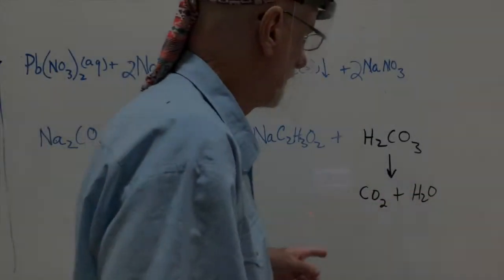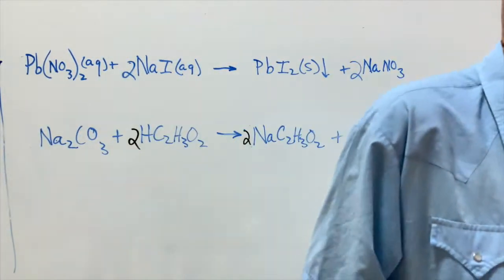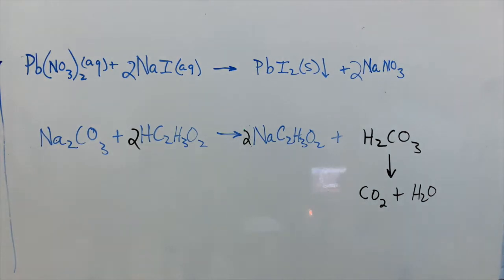Excellent. Now, I just want to review these two equations, and I'm going to do a couple of labs, quick demonstrations on what we're talking about, by the production of either a precipitate or something molecular, like a gas or water, to drive a reaction. This is serious chemistry. Okay?